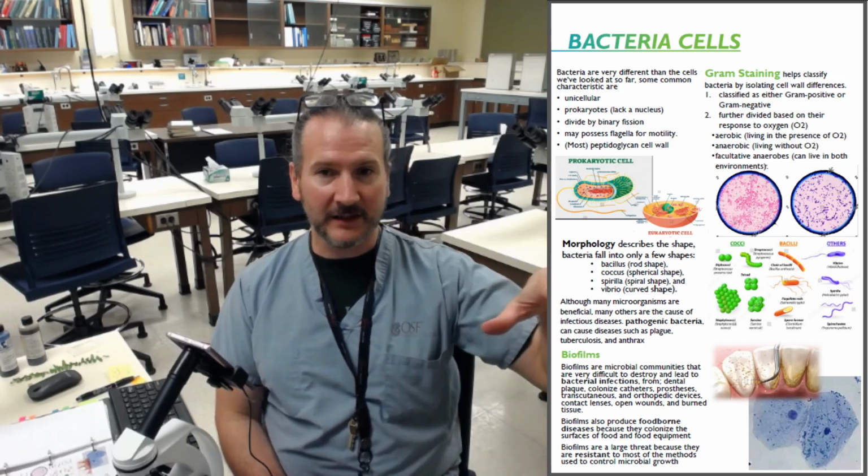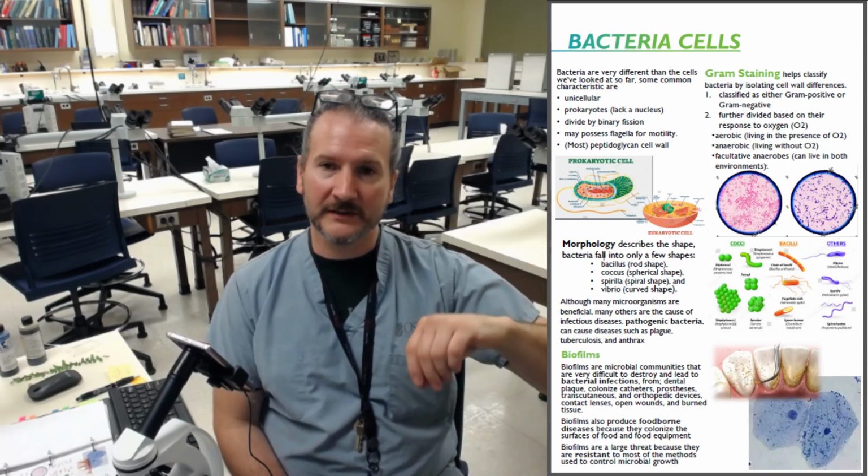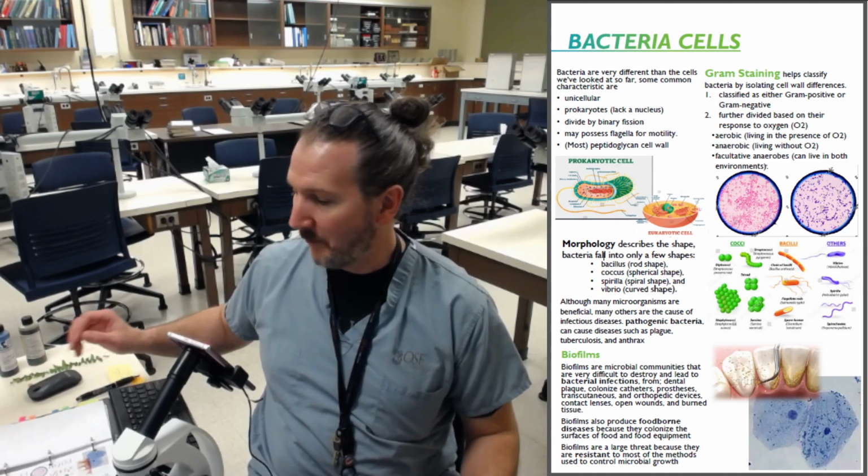I think of my shower curtain, that's mostly minerals, but anything that has a rough surface, bacteria can hide and grow in there. So it can start turning colors. You might get fungus that grows in there. Bacteria, the fungus usually will change the color of it too, so it looks all nasty. Well, let's see if we can find a biofilm on you.